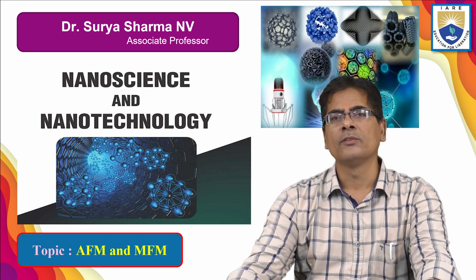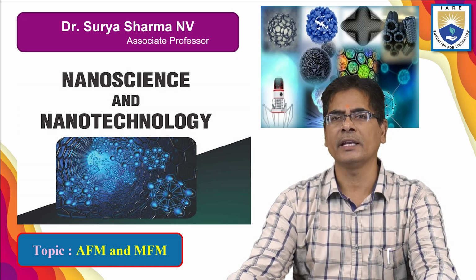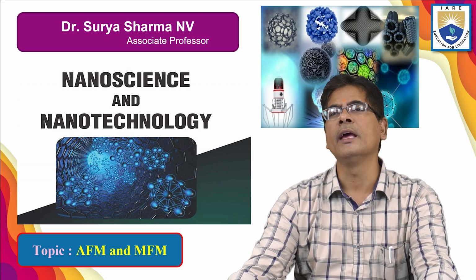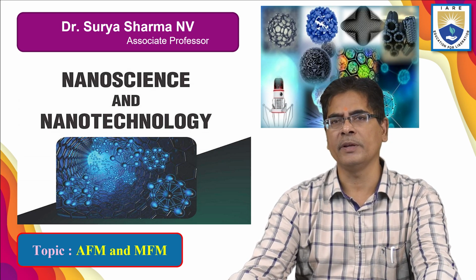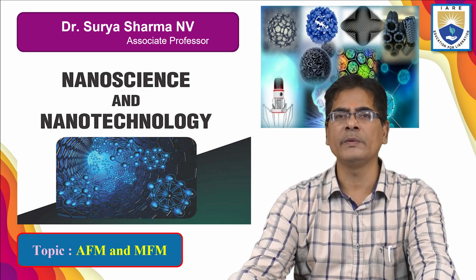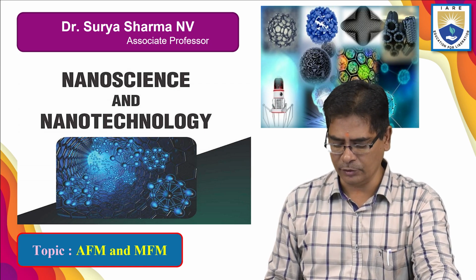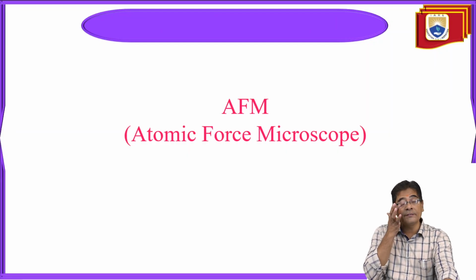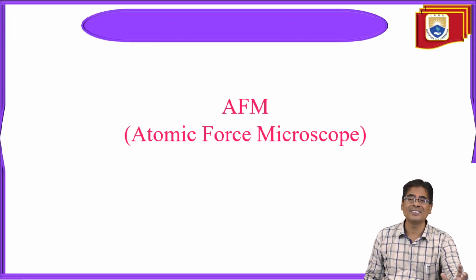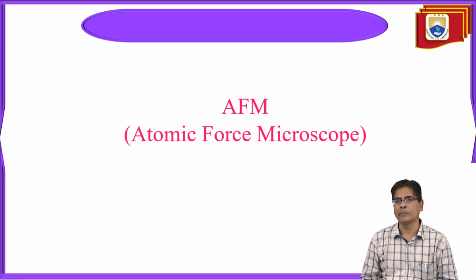So in today's lecture, we will see some more characterization techniques. Already we have become acquainted with techniques like AFM. AFM represents atomic force microscopy, and MFM represents magnetic force microscopy. In today's lecture, we will see the basic differences between atomic force microscopy and magnetic force microscopy. First of all, let us see what atomic force microscopy is, as we have seen already in our previous lecture.